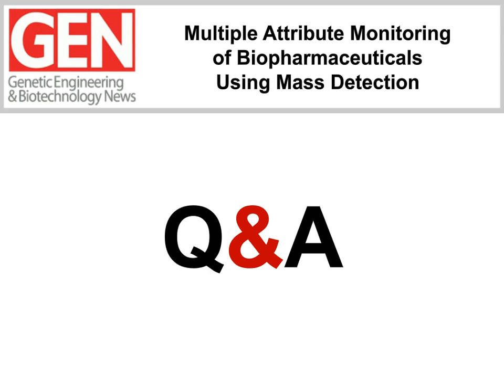All right, thank you. So this next question is a little bit long and in a couple parts, but an audience member wants to know, is there any reagent kit for increasing the charge state of large peptides and proteins to make them fit for QDA detection? Does RapiFluor and the workflow have to be used with QDA, and what is its performance on other mass specs? All right, so that is a number of questions.